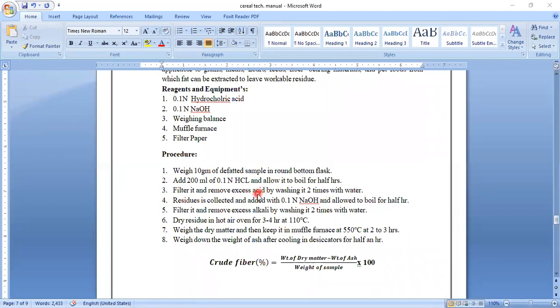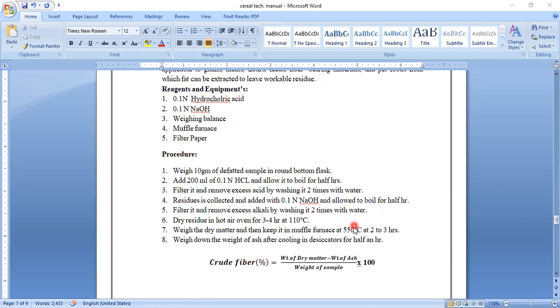Once boiling has been completed, filter that mixture and remove whatever acid was added — excess acid should be removed by washing with water. Then whatever residue is collected, add 0.1 normal NaOH and again allow it to boil for half an hour. Then filter it and again remove the excess alkali — NaOH is the alkali — by washing it two times with water.